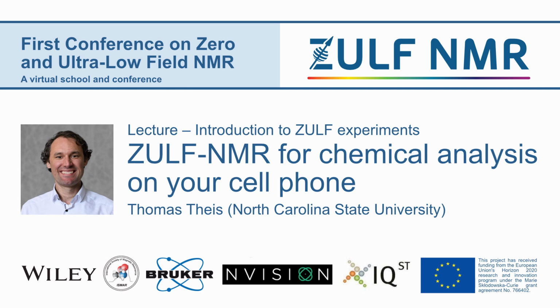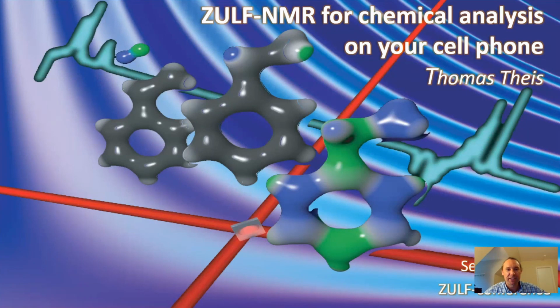I'm going to be talking about ZULF-NMR, and what motivates me personally about ZULF-NMR a lot is the potential to miniaturize NMR and to potentially drive it towards applications that are portable NMR, and maybe as a dream, as a goal, to be able to do this on your cell phone. And I do think that especially Michael Taylor, who's talking right after me, is particularly close to this goal. So that's, of course, very exciting. And so we shall see how this research unfolds.